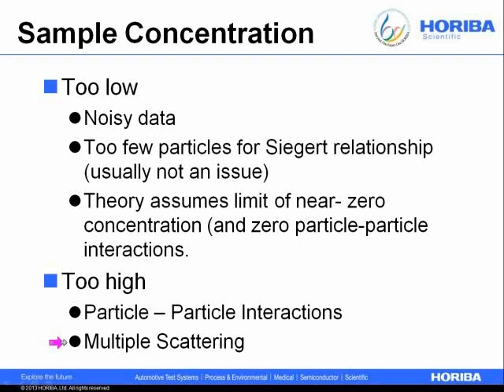That also distorts measurement results. Now, particle-particle interactions, of course, persist no matter what you do to your optics. There are some arrangements that get you around multiple scattering in the SZ100, but because of this, I tend to prefer working with dilute suspensions.